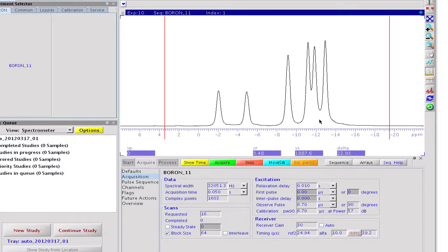By zooming into the signal region, six well-separated lines are displayed. Although vinyl decaborane has 10 boron atoms, due to symmetry reasons, there are four magnetically equivalent boron pairs. These are seen on the right with doubled intensities.